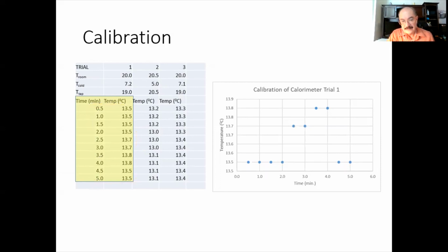Excel decided that I wanted to have a very minute, very precise view of this data and spread it out. You can see on the left side there, the y-axis, what Excel did was it took the maximum and minimum data sets that I had, and it spread them out over essentially 0.4 degrees. The problem is my thermometer can only go to 1 decimal. I cannot even achieve this level of precision. And what it does is it gives you a false sense that there's a lot of variation here.